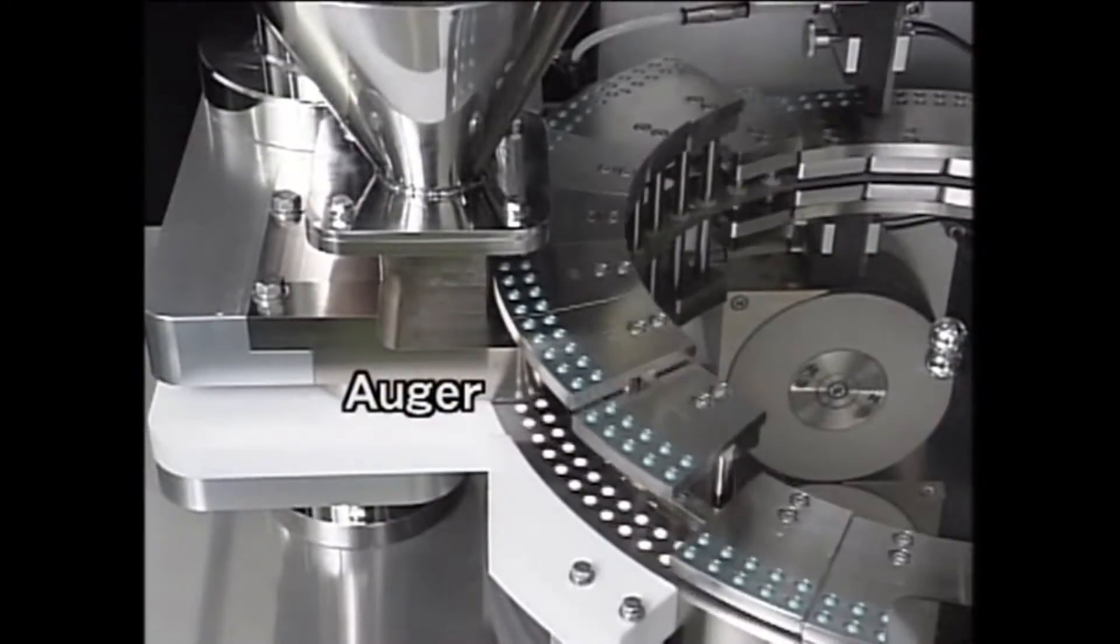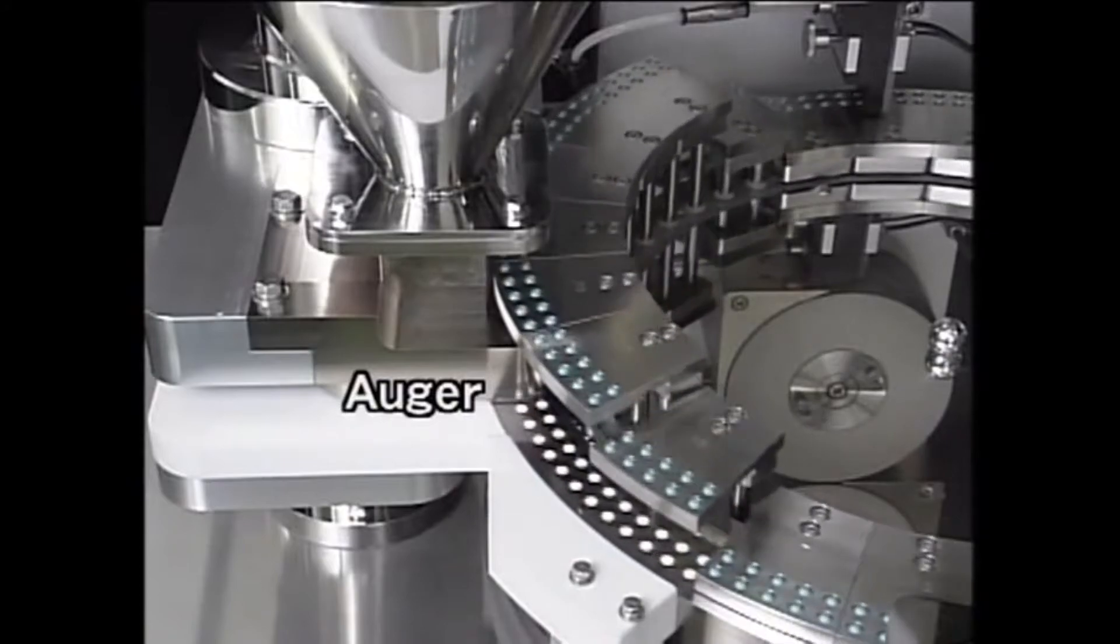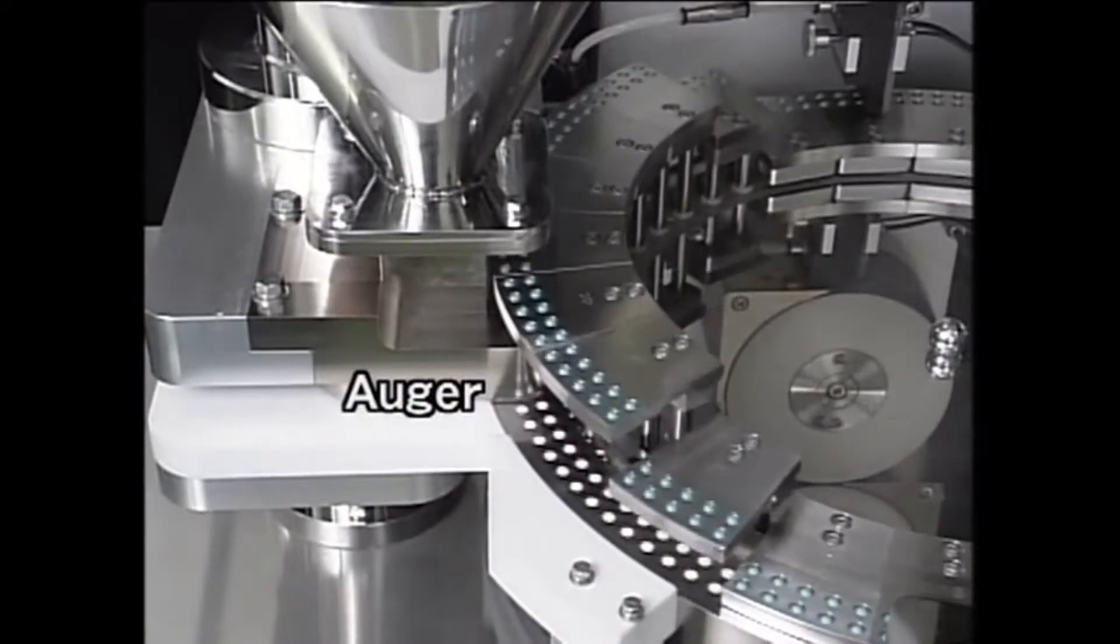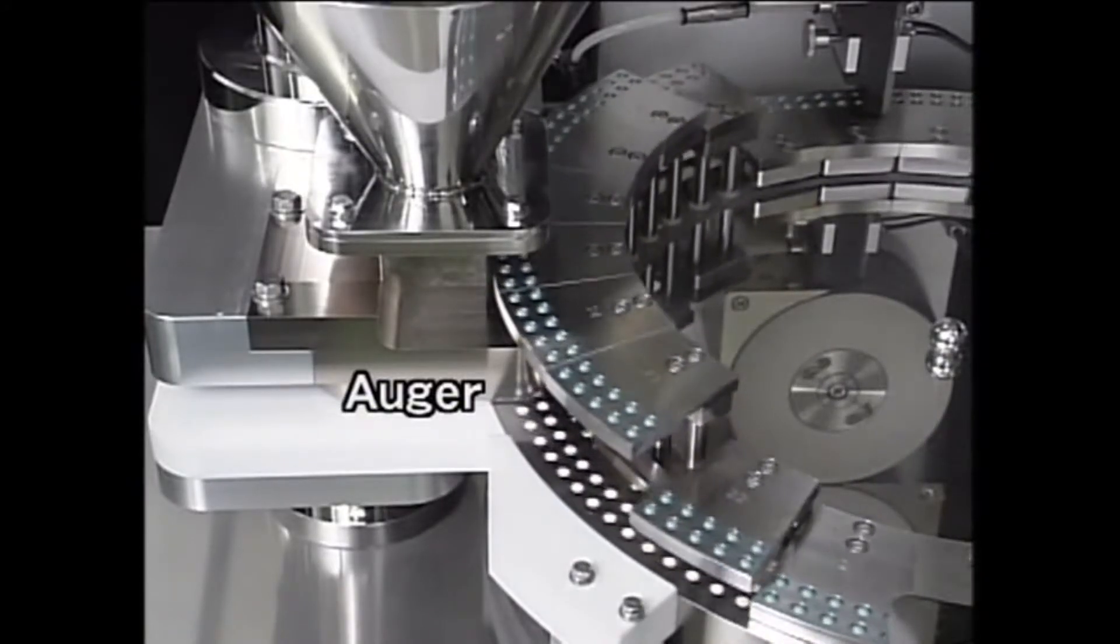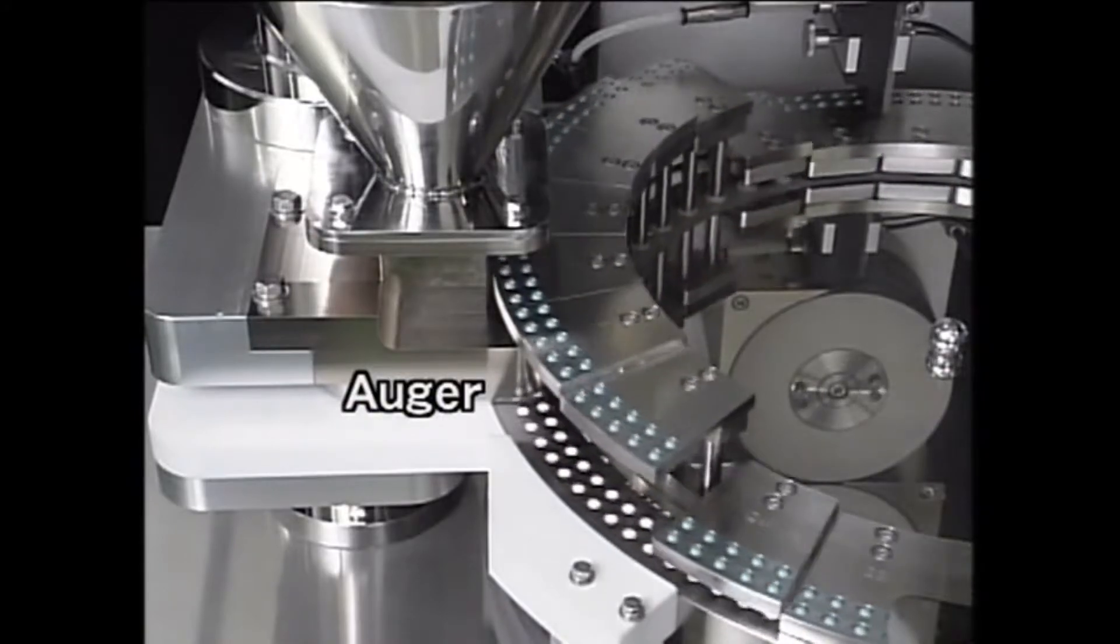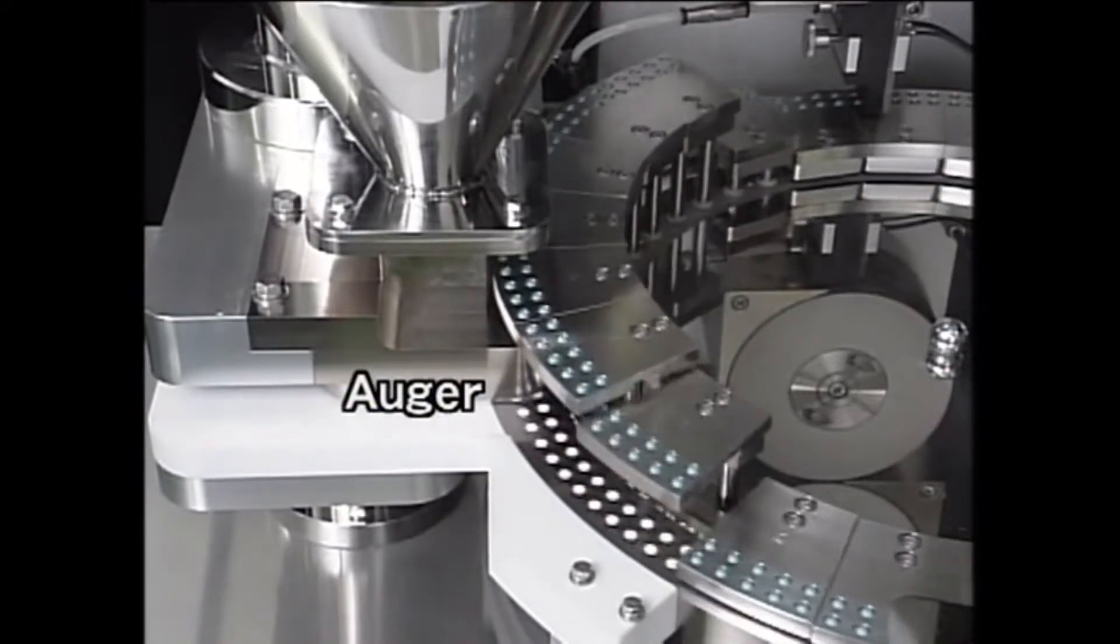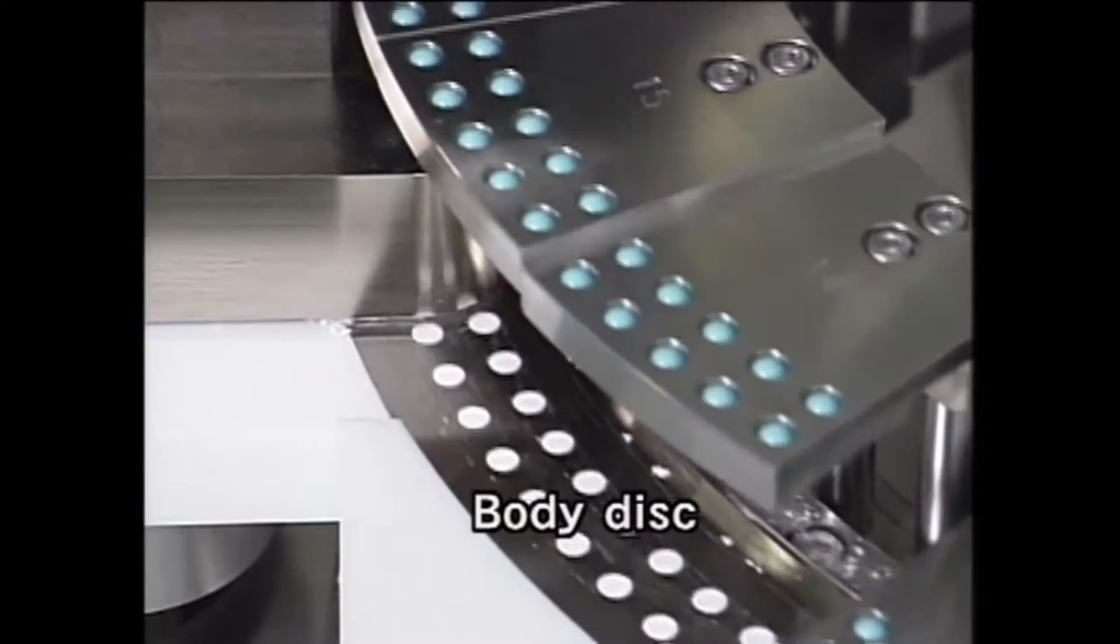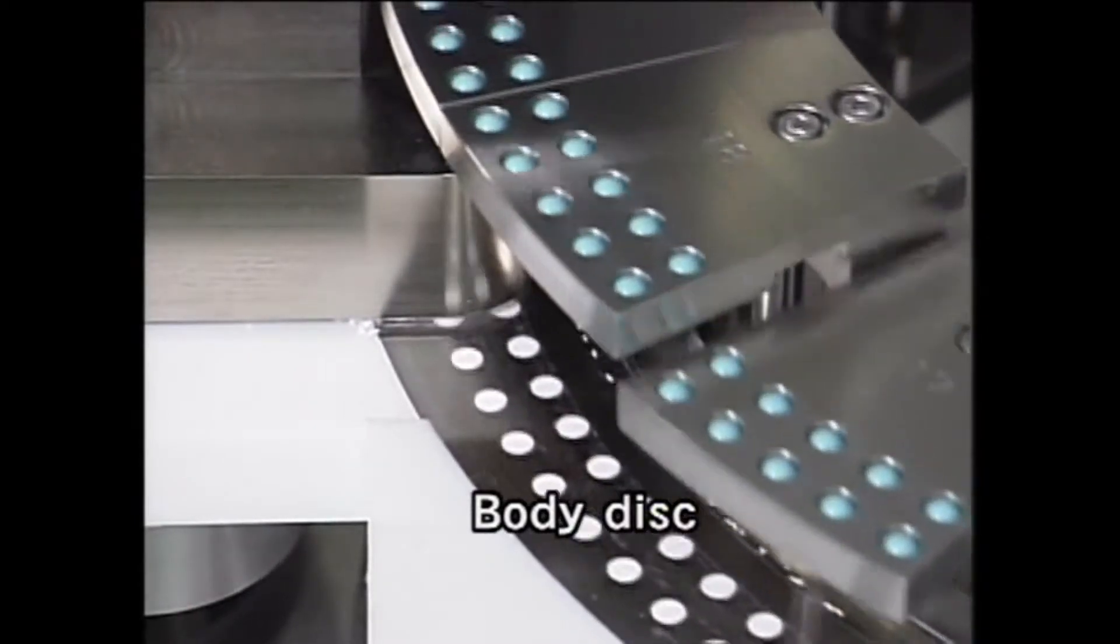In the case of filling with powder, the powder in the hopper is mixed as well as stirred by a rotating arm. After that, the powder is continuously filled into capsule bodies by pressure applied via the auger at the lower part. The pressure to be applied can be set by altering the rotation speed of auger and twist angle.